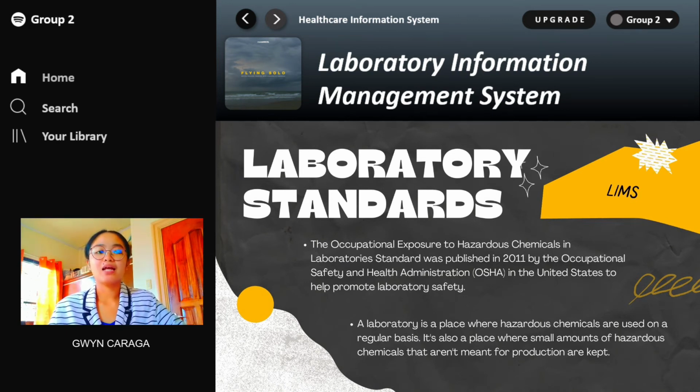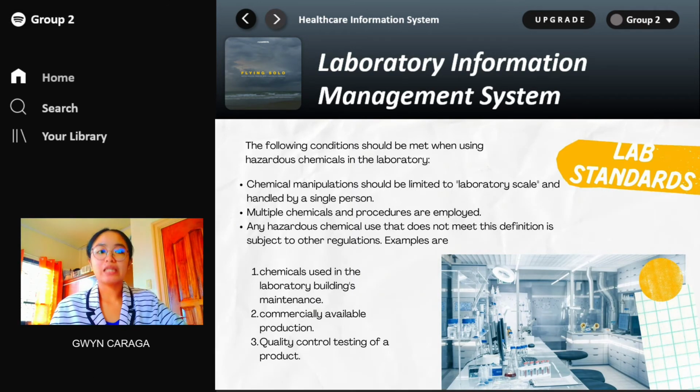So a laboratory is a place where small amounts of hazardous chemicals that are not meant for production are kept. So doon gina-keep yung mga hazardous chemicals na hindi naman magagamit or hindi siya meant for production. So, laboratory standard. These are the following conditions that we should meet when using hazardous chemicals in the laboratory, or the laboratory standard.